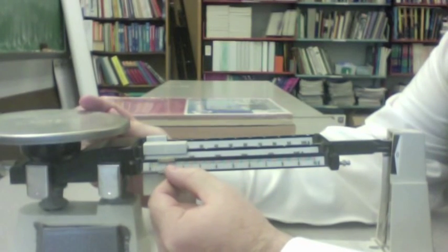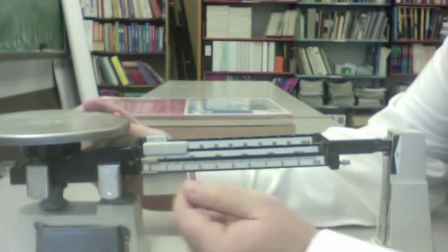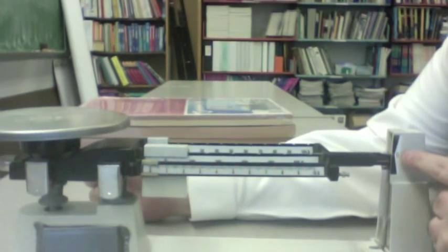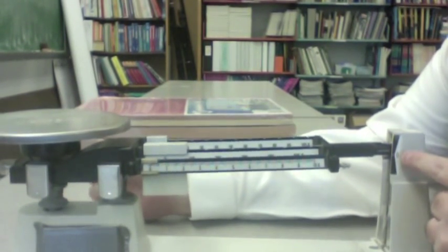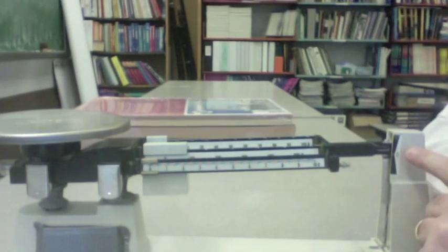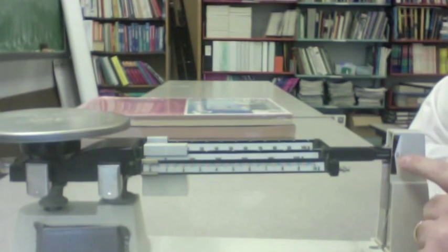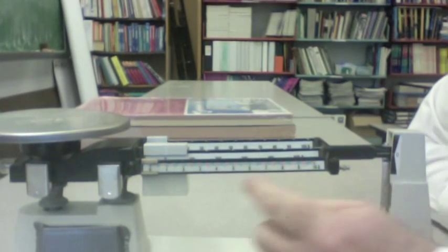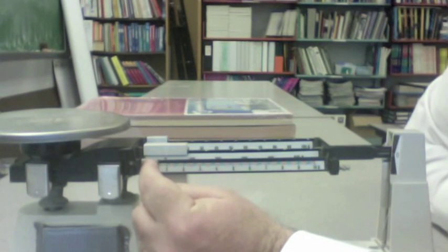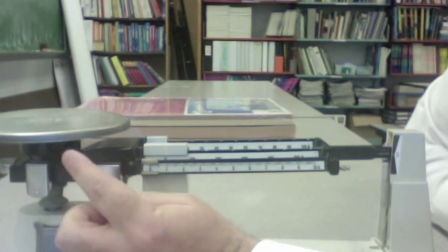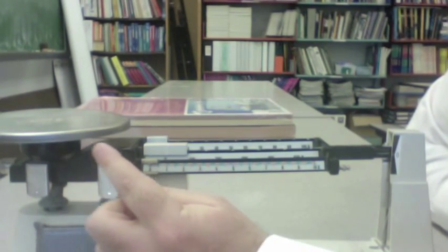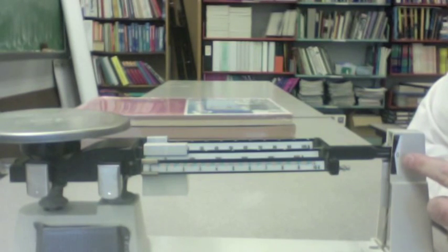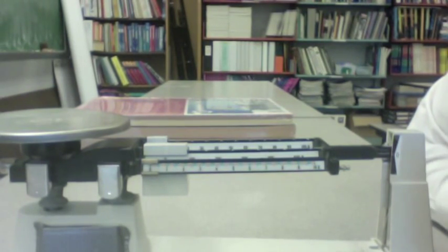We know it's balanced by looking over here at the zero point. And before you even start to use your triple beam balance, you want to make sure all the sliders are at zero, there's nothing on your pan, and that this little pointer is pointing at the zero. Looks like we're all set to go.